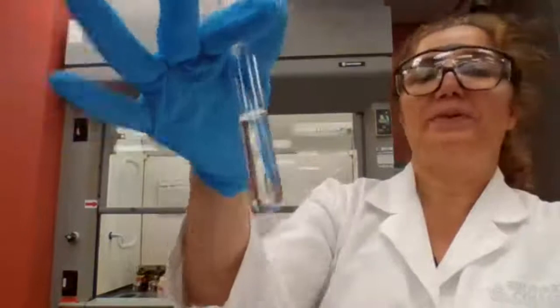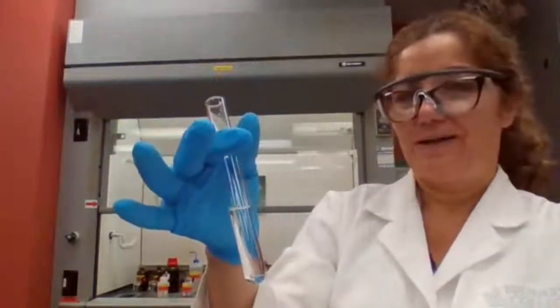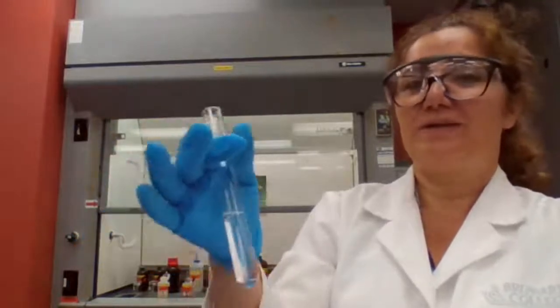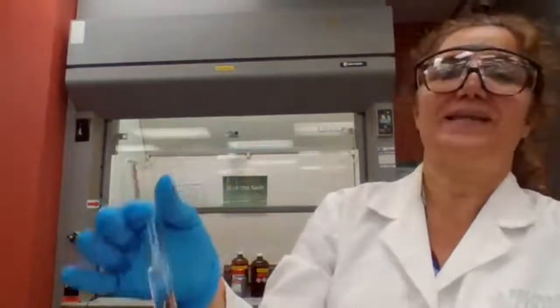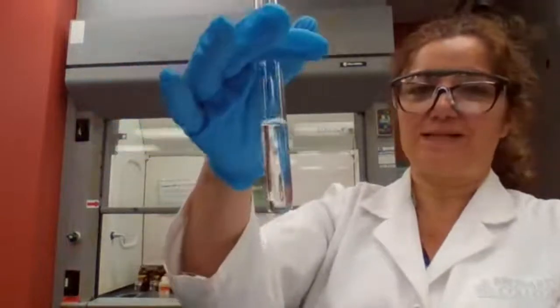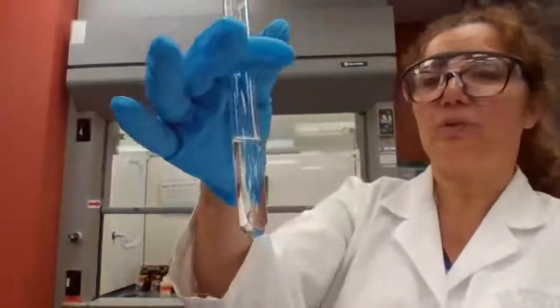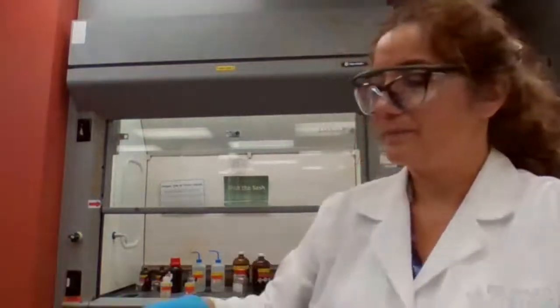But I won't be able to use the sodium hydroxide or HCl for this one because it dissolves. If it dissolves in water, it dissolves in sodium hydroxide, it dissolves in HCl, and it doesn't give me valid answers. So all I can say is that this is a polar compound with less than 5 carbons, and it does make sense. If you have sec-butylamine, it will dissolve in water. And for this amine, you should not continue with sodium hydroxide or HCl.